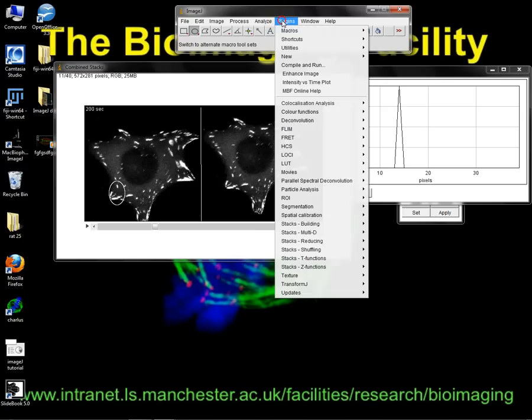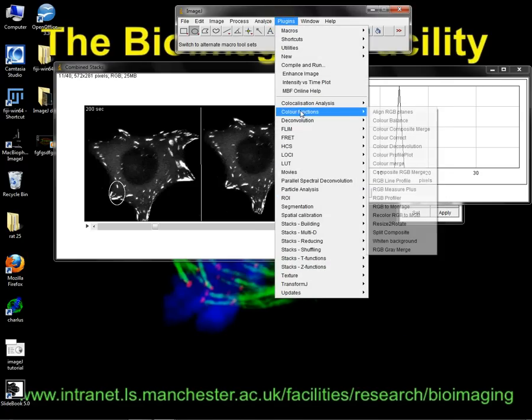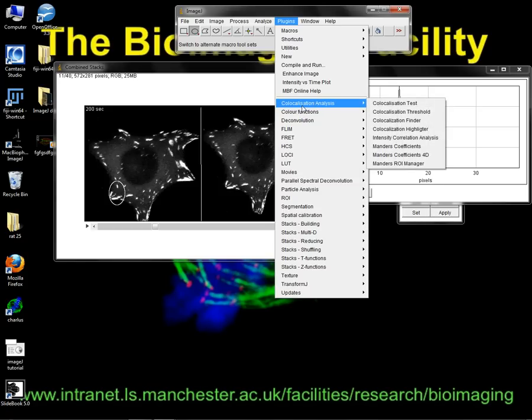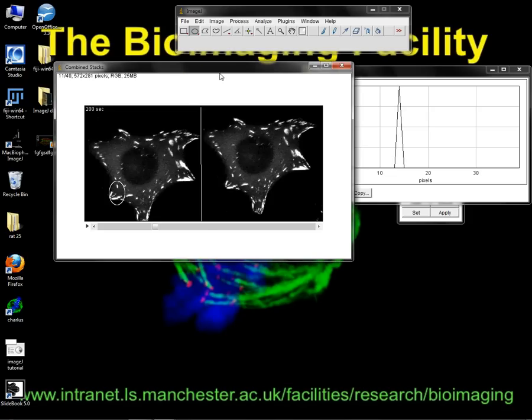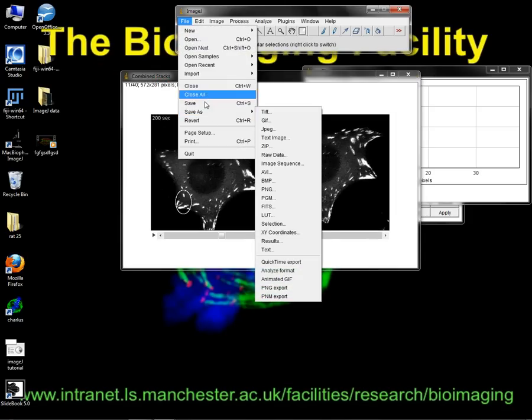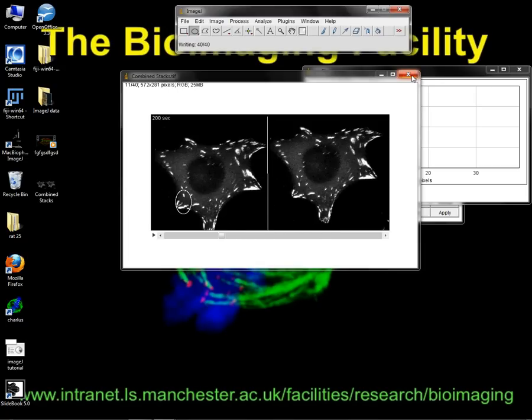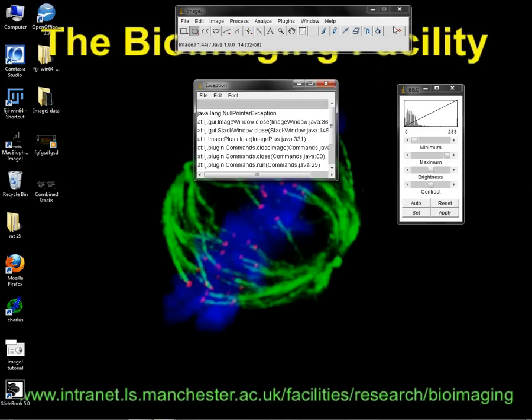Now, this is where some works better in low, what do you call it? I'll tell you what, let's save that movie. So file, save that, and we'll just save that as combined stack. Boom, all right, close all that.